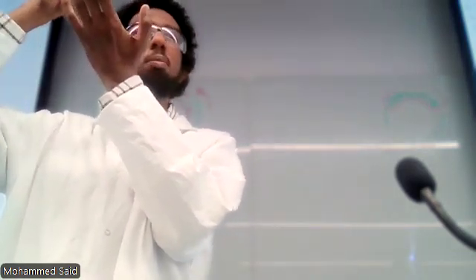Just make sure, let's say you're done. Remember, in about an hour and a half, I don't want to forget this, so please don't forget as well. In an hour and a half, you're going to have a pellet at the bottom. So make sure, following conjugation, you resuspend in an hour and a half's time, roughly. When your group is done, please hand them the two screens, and I should be able to take them.